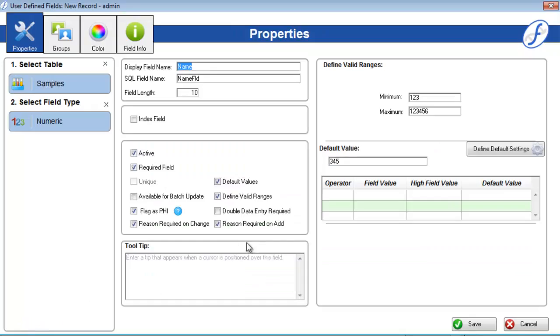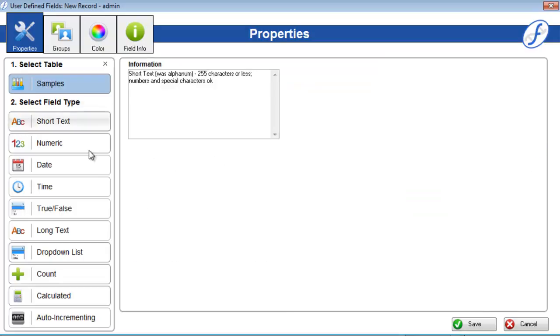As you activate extra properties, more configuration options will appear in the boxes on the right. A numeric field can only have two boxes filled, but a drop-down list field can have all three.